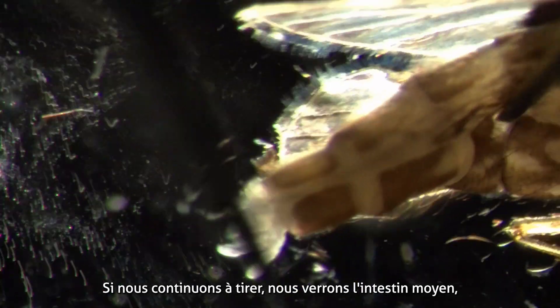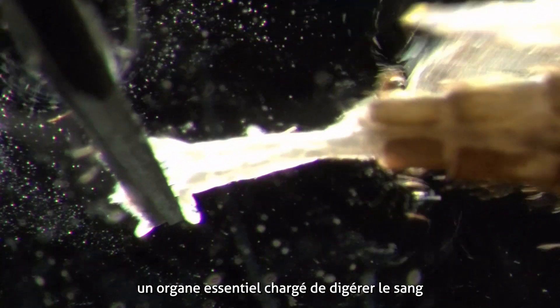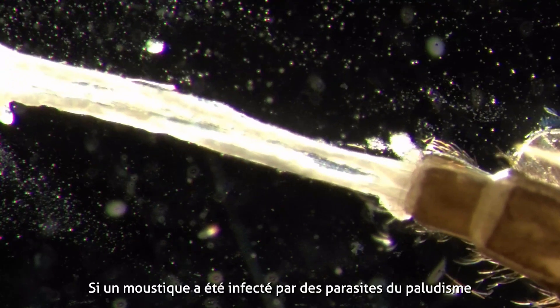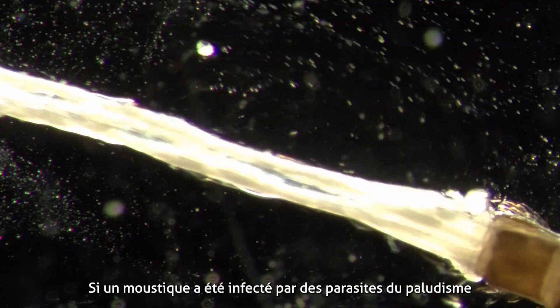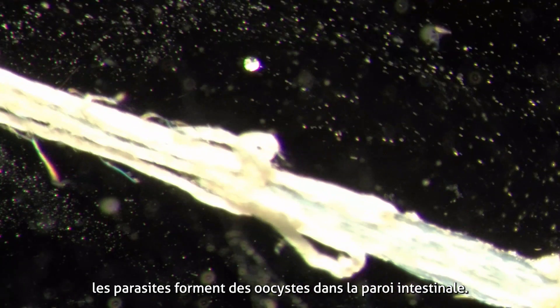Now if we continue pulling we will see the midgut, an essential organ responsible for digesting the blood after the female mosquito has fed. If a mosquito was infected with malaria parasites when consuming their blood meal, the parasites will form oocysts in the gut wall.